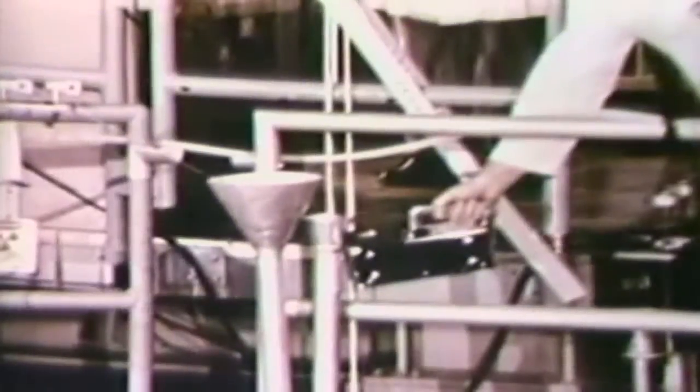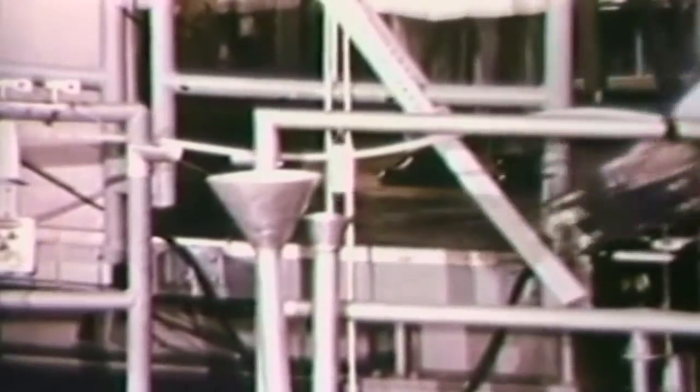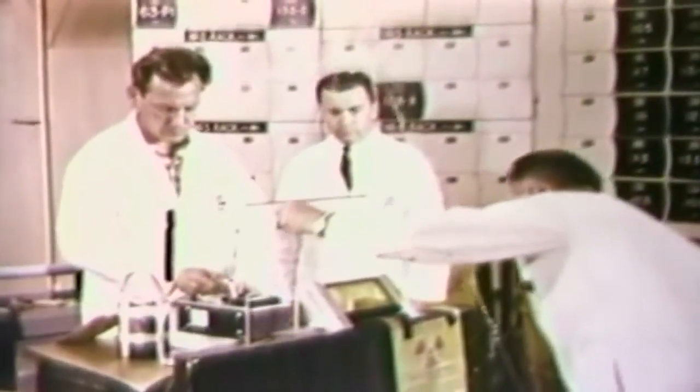After a predetermined time in the reactor core, the now radioactive samples are removed. A health physicist checks the radiation level to ensure safe handling. The container with contents is carried to a work area and placed behind a protective shield.